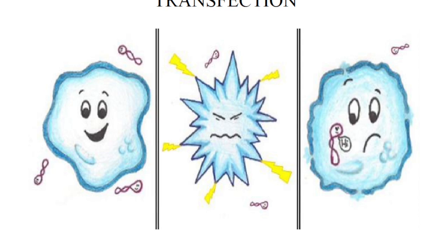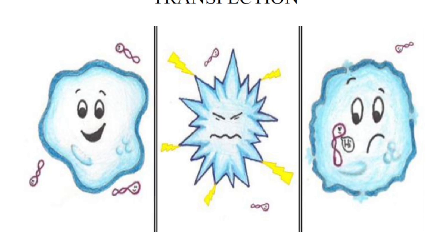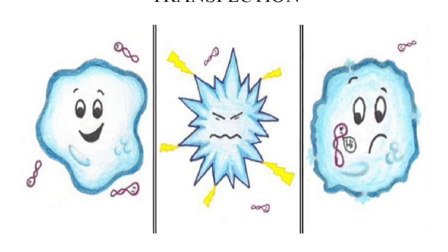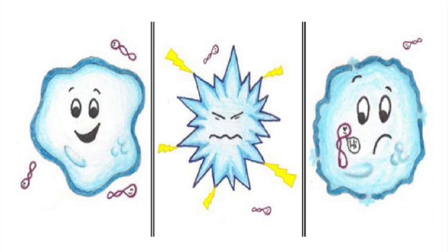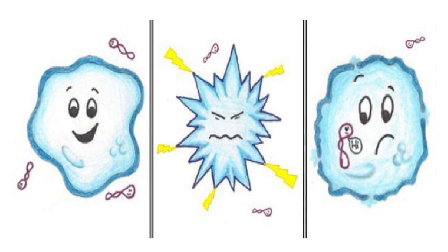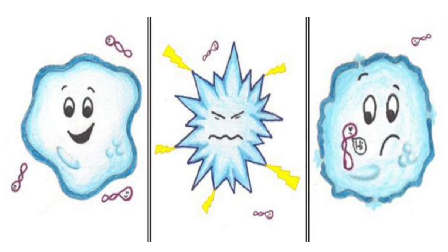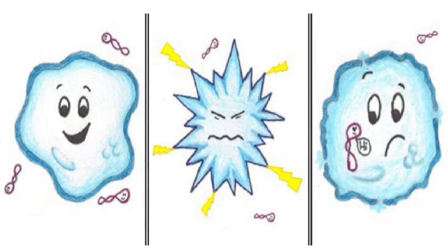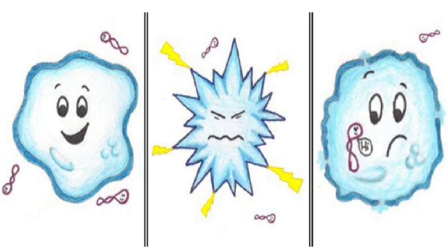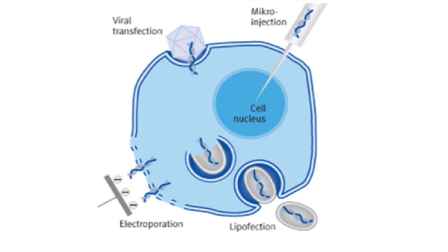Transfection consists of the introduction of external genetic material into eukaryotic cells by means of plasmids, viral vectors, microinjection, lipofection, where the genetic material is mixed in a liposome which is absorbed by the cells, or other tools for the transfer. The term transfection for non-viral methods is used in reference to mammalian cells, while the term transformation is preferred to describe non-viral transfer of genetic material in bacterial and non-animal eukaryotic cells, such as fungi, algae, or plants.